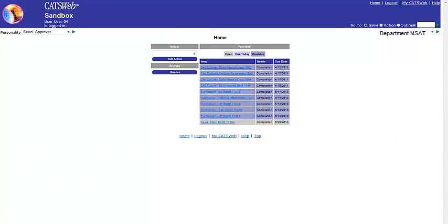To begin the cell culture process, we need to first define our personality and role. We will select Cell Culture Data Entry. Make sure you click the green arrow so that the screen will refresh.